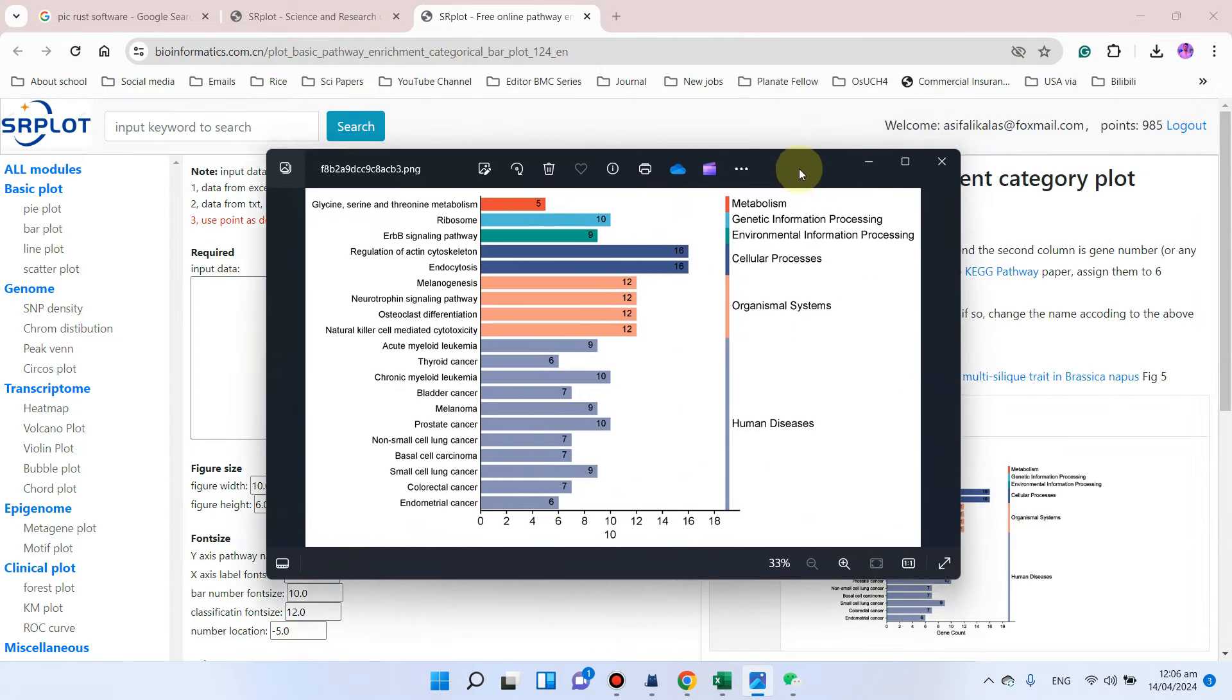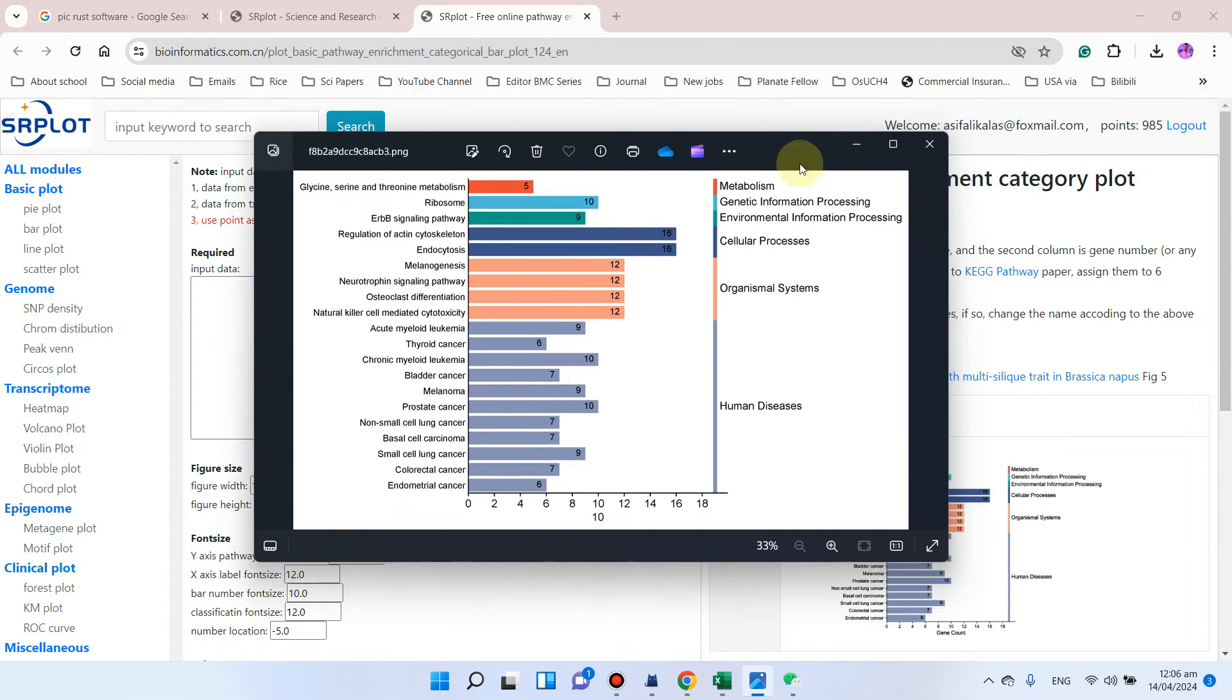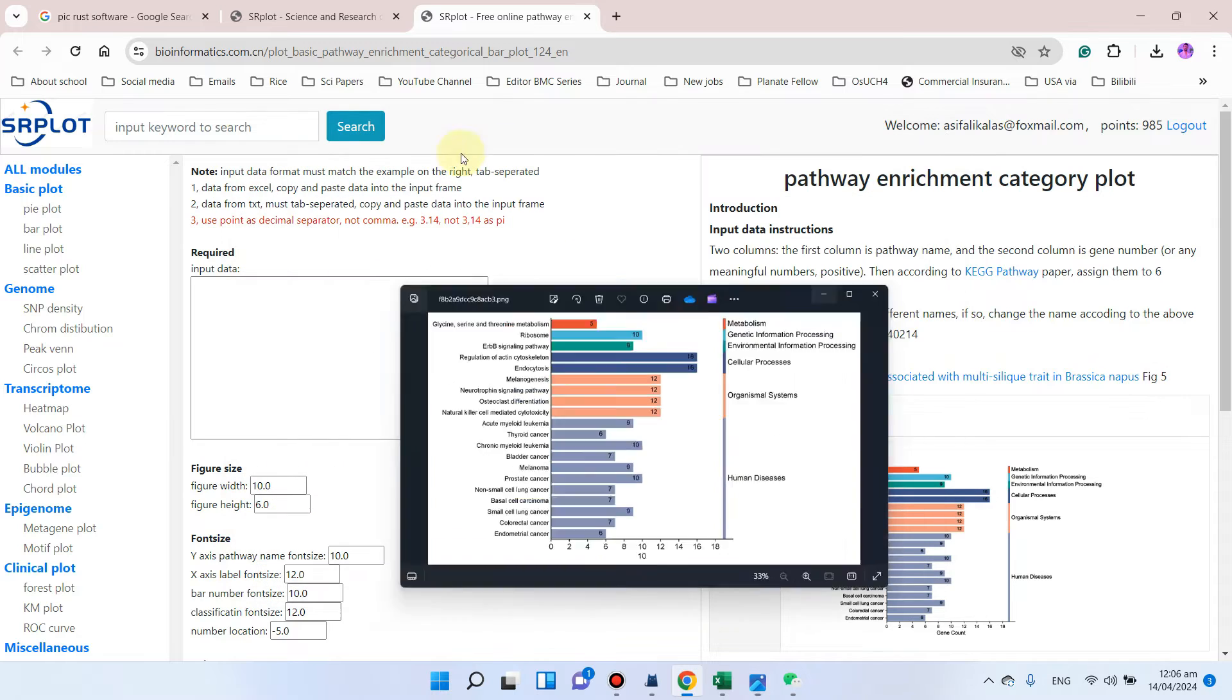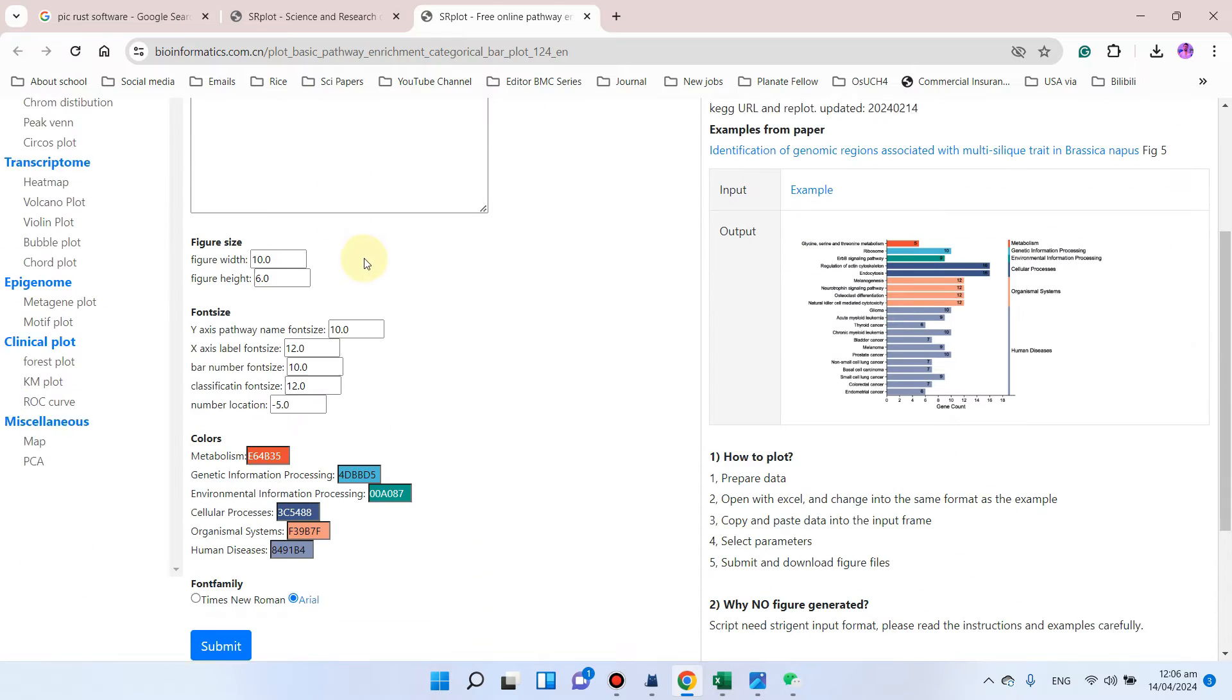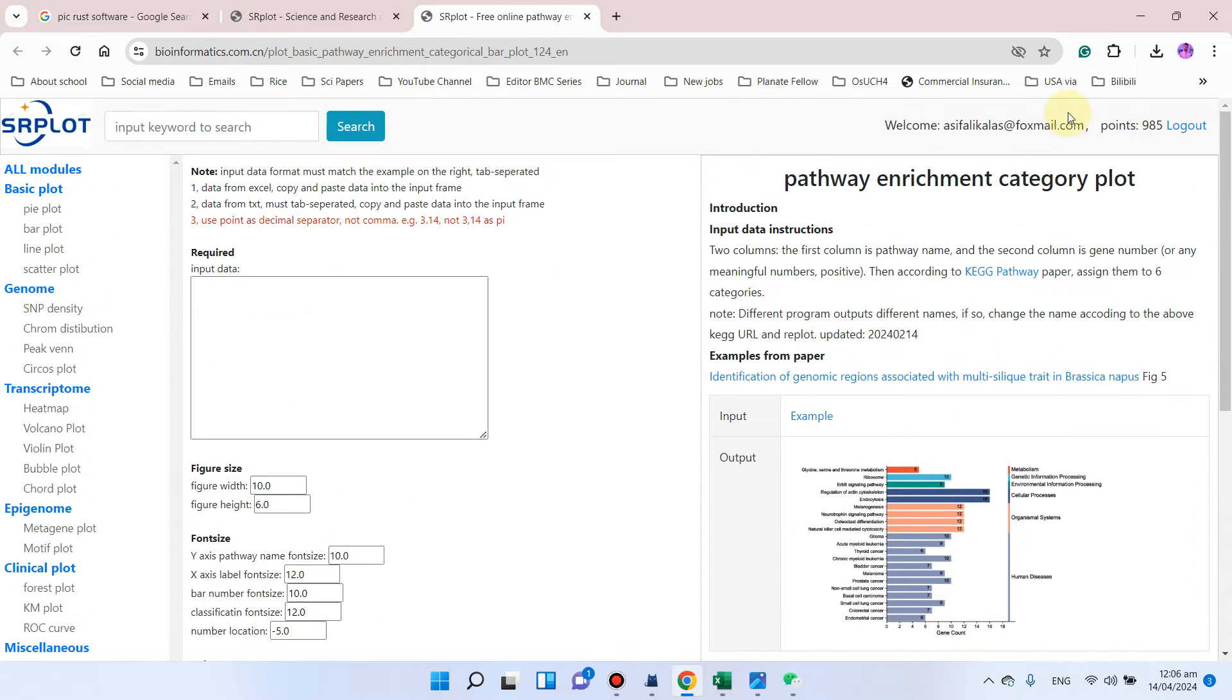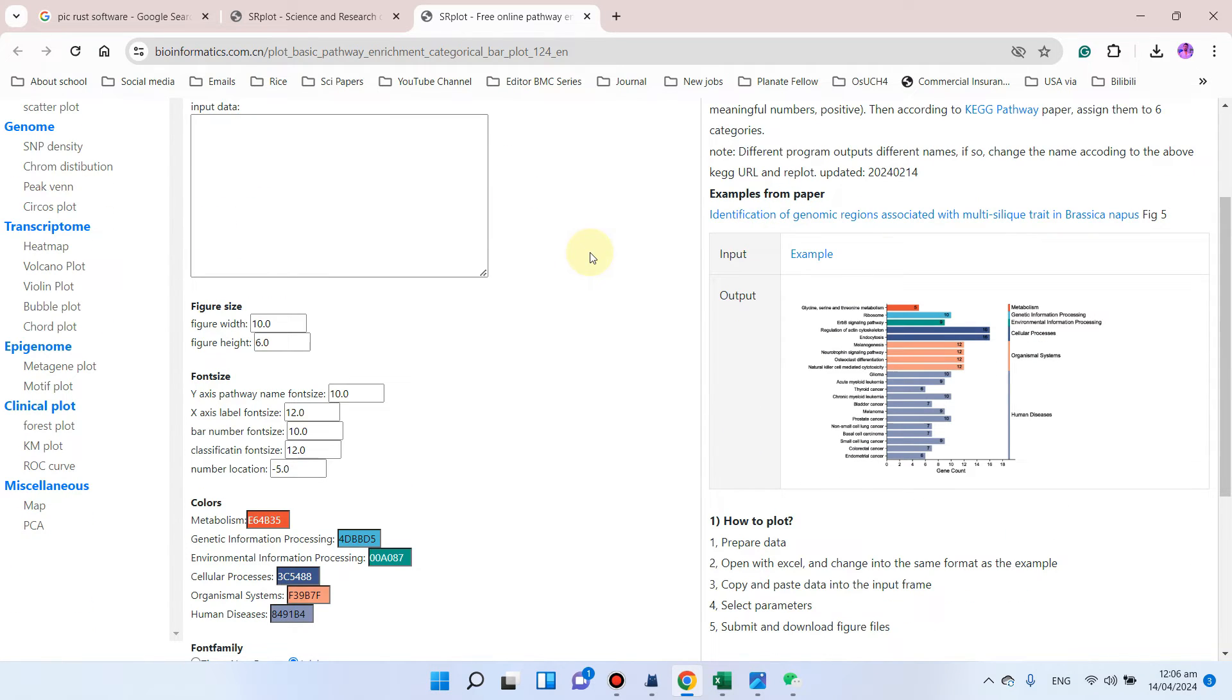For this we will be using the srplot website, and as we know, this srplot website is totally free for researchers and you can create a free account on this.